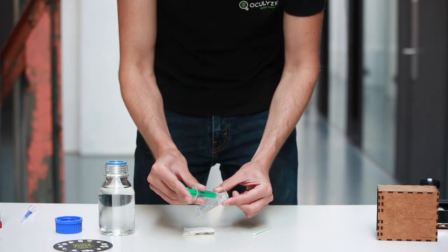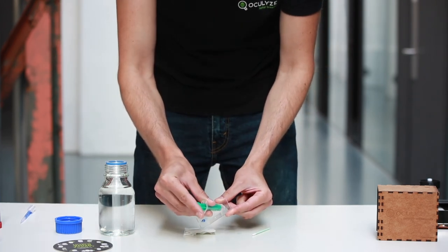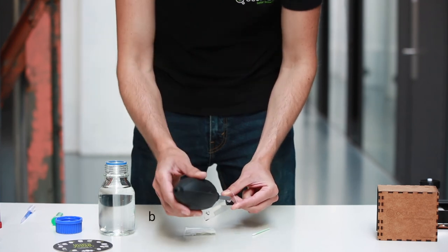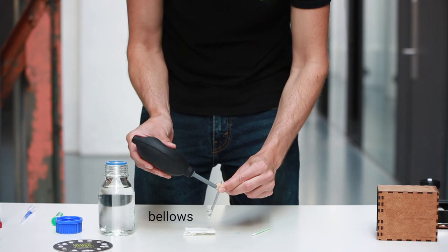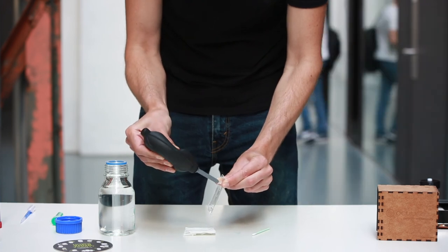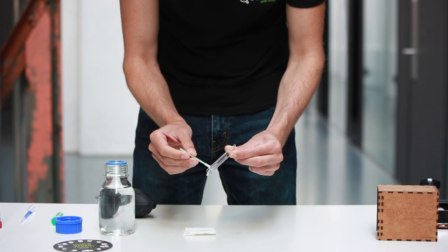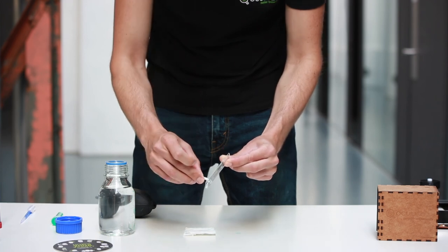Step 2. Rinse the chamber with distilled water. Step 3. Use the bellow to dry the chamber. Pump the bellow to blow air through the chamber. Use a small piece of tissue at the end to collect the water.